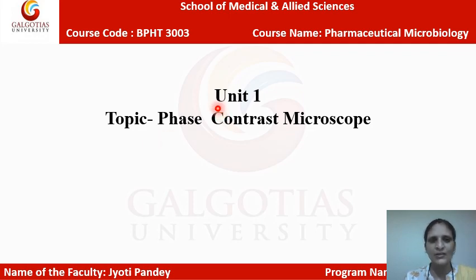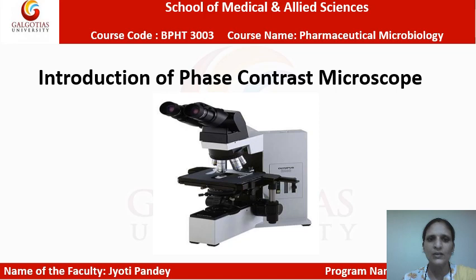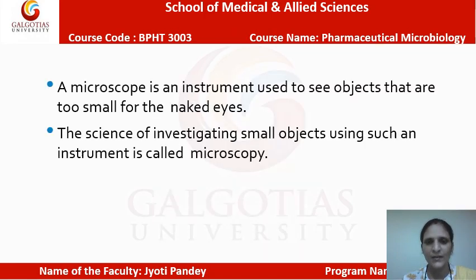Good morning everyone. This is Jyoti Pandey and today's lecture topic is description of phase contrast microscope. This topic includes the description of phase contrast microscope, their importance, their types and their applications. This is the diagram which represents the phase contrast microscope structure.